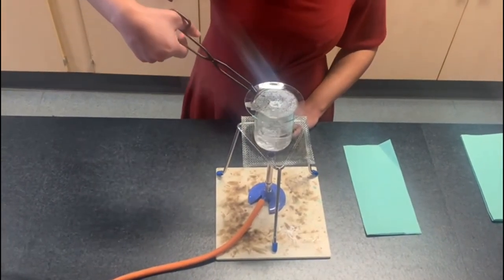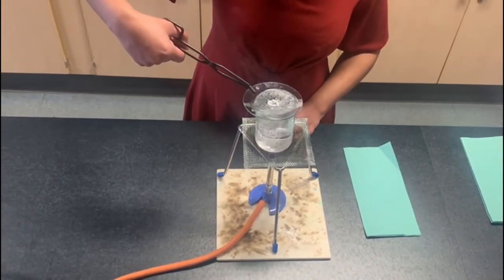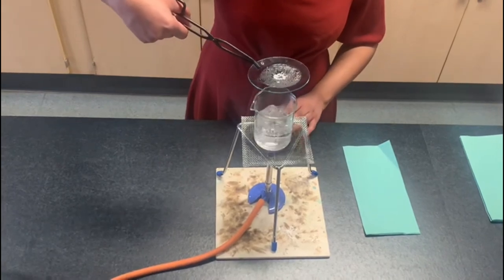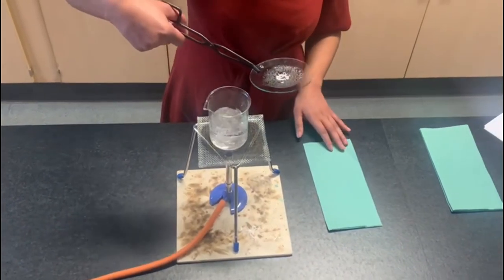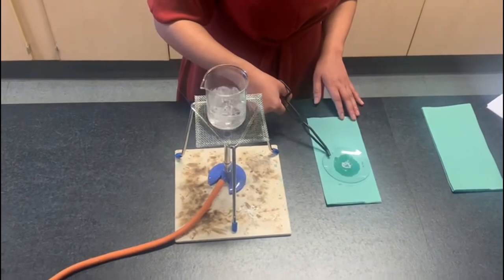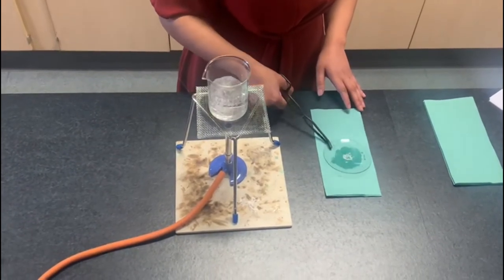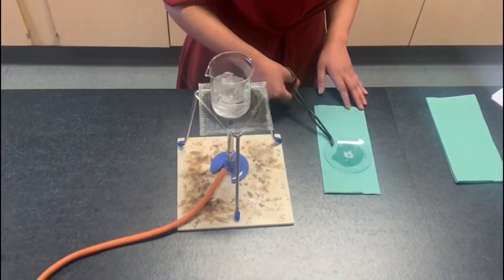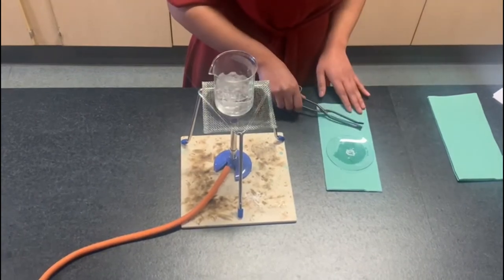Okay now that all the water has been evaporated, I'm going to take the watch glass off the water bath using tongs and place it on top of a paper towel so all the excess water can be removed before placing it on the balance.